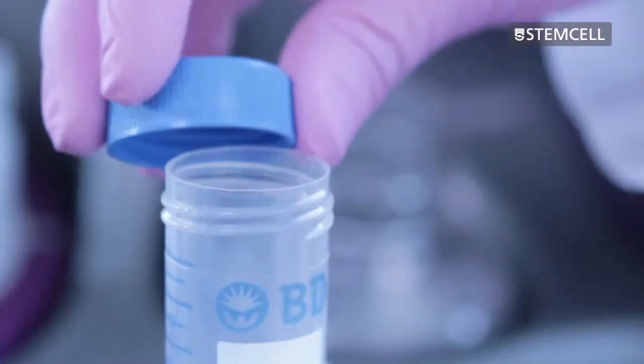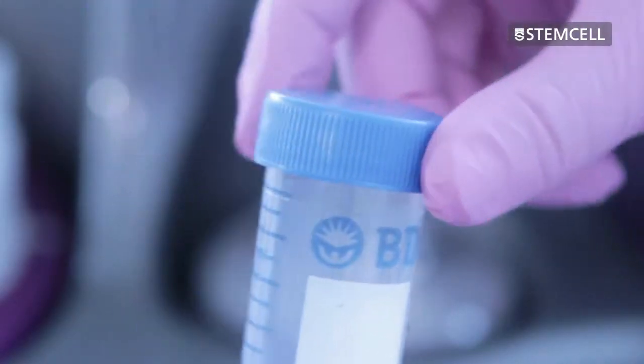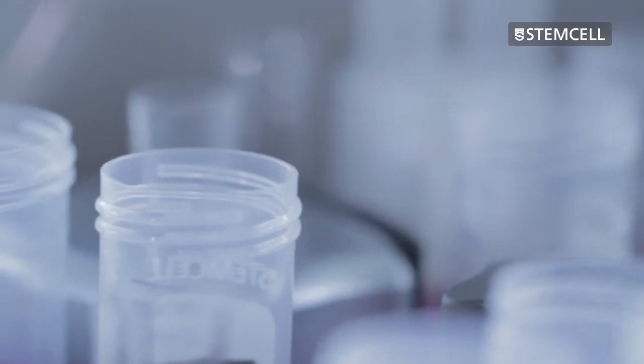Next, cap and unload the reagents and then store appropriately. Lastly, cap the rest of the tubes and unload the rest of the unit.